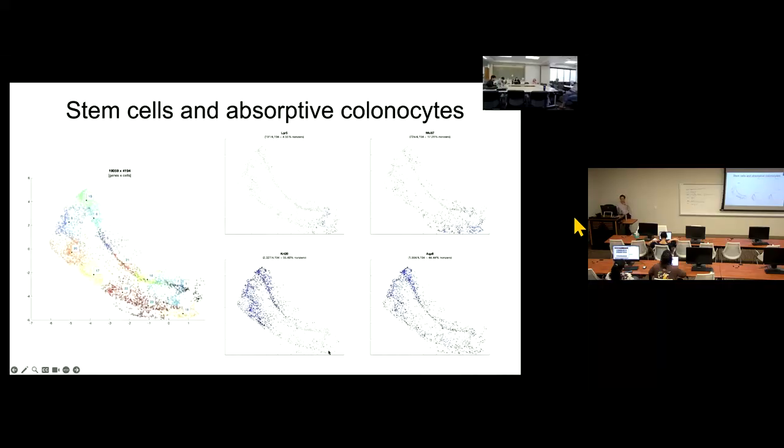So this is what I have to do. I just have to look at the expression across these figures here and then try to label these clusters as a specific cell type. Again, this isn't finished just yet. I need to input a lot more details into this so that somebody can actually follow it. But for the most part, this is how we identify cell types in the colon.